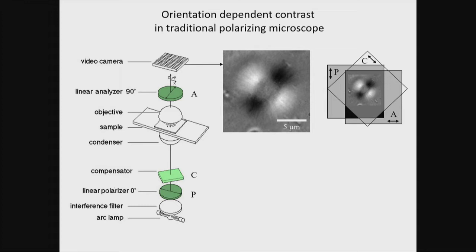It's unlabeled, unstained, can be a living cell, and I'll show you some pictures later, that has not been interfered with. So it's Shinya Inoue who really discovered that in the 50s, that this can be a beautiful technique to study cell division, for example, what kind of structures come and go as a cell divides, and you can make beautiful movies and study the structural composition.